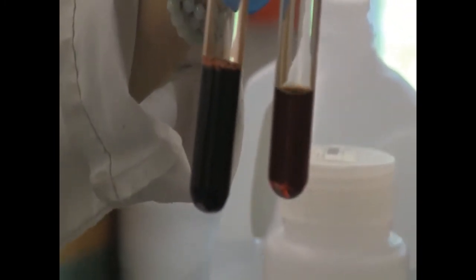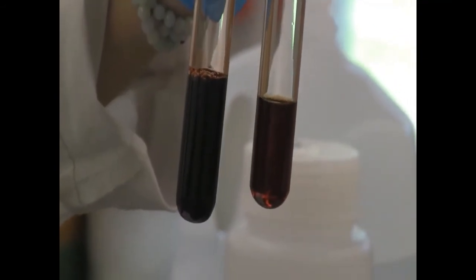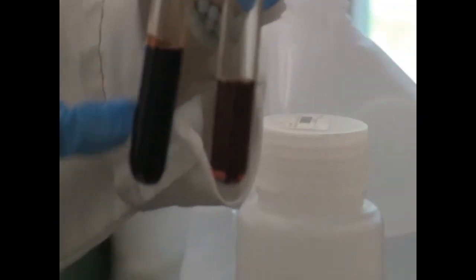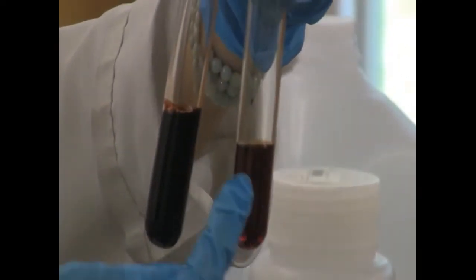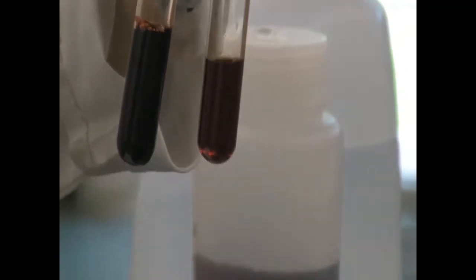This is a control. See the difference? So which direction is it shifted to? Yeah, this control would be the color of the product, iron thiocyanate. Now this color means what? More of this color or more of the original reagent's color? Think about that, compared to the color you put in your report.